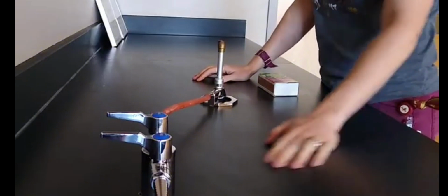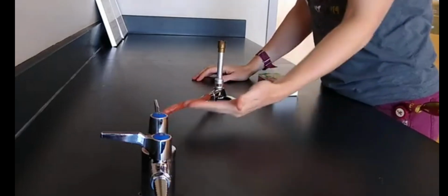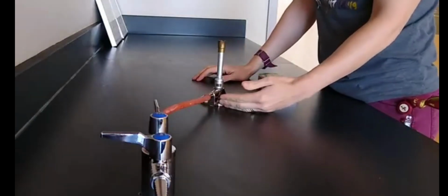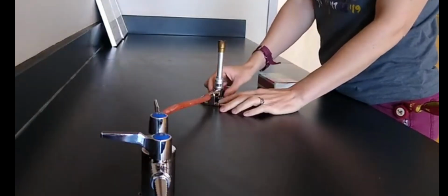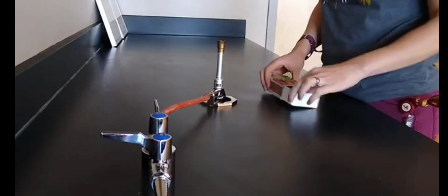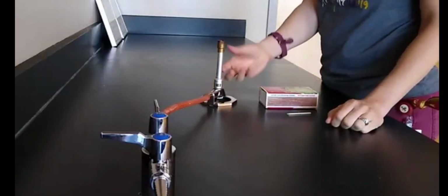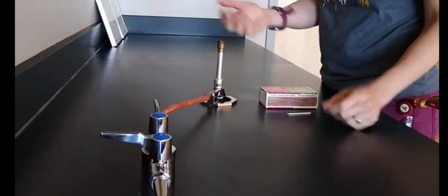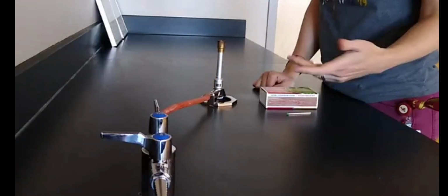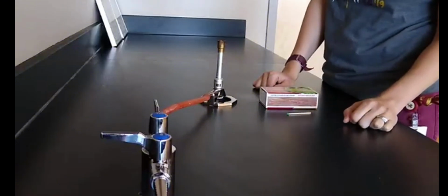So first off, we always start at the table. This is our gas jet. We make this parallel, and that allows the gas to start filling our rubber tube here. But it's not leaking into the classroom right now because the valve on the bottom is closed. Before we open the valve, we should have a match ready, because when we open the valve, gas will start to come out of the Bunsen burner, and if we have to fiddle around getting a match out, that's time where we're leaking gas into the classroom, so it's something to be avoided.